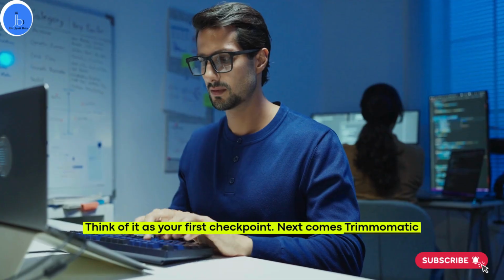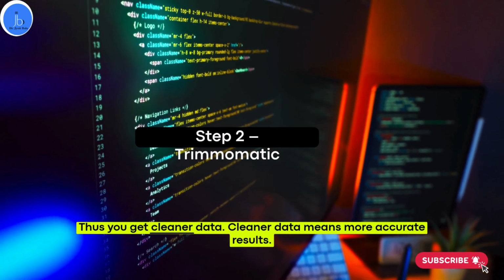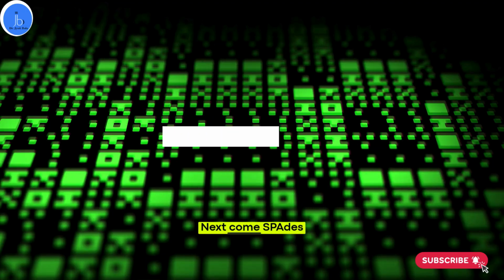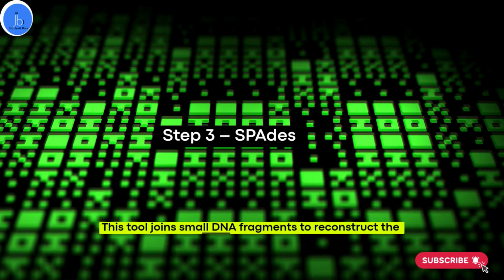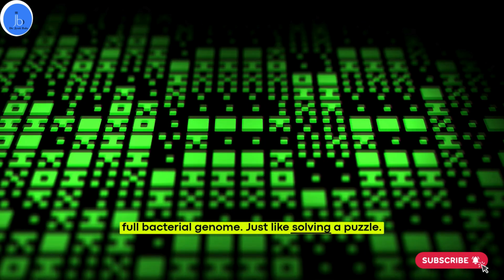Next comes Trimmomatic. It removes low quality reads and adapters. Thus you get cleaner data. Cleaner data means more accurate results. Next comes SPAdes. This tool joins small DNA fragments to reconstruct the full bacterial genome, just like solving a puzzle.